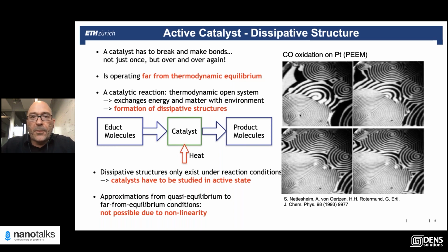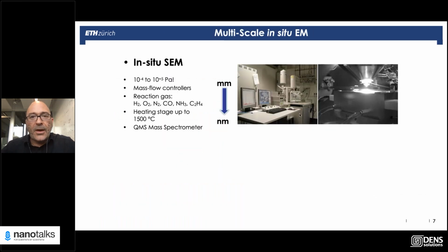Now, if you turn off the reaction, they are gone and you cannot see them. And you would not know that they are there when they are under reaction. So this is the point that I want to make. You have to look at systems under reactive conditions. So now I have said this, and I also mentioned that you need to try to put things into some kind of a context embedded picture.